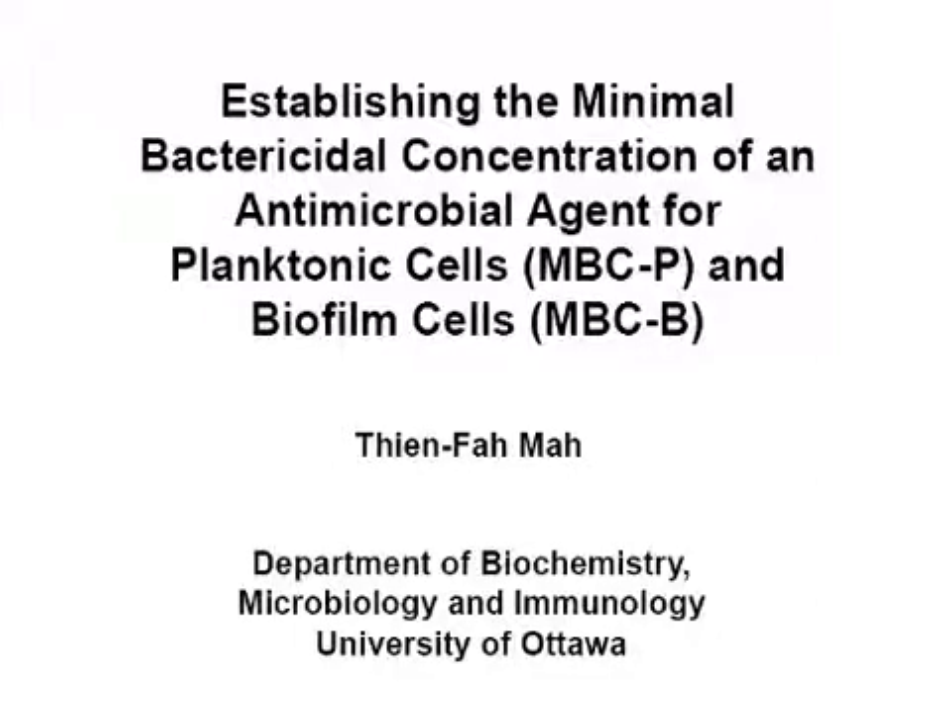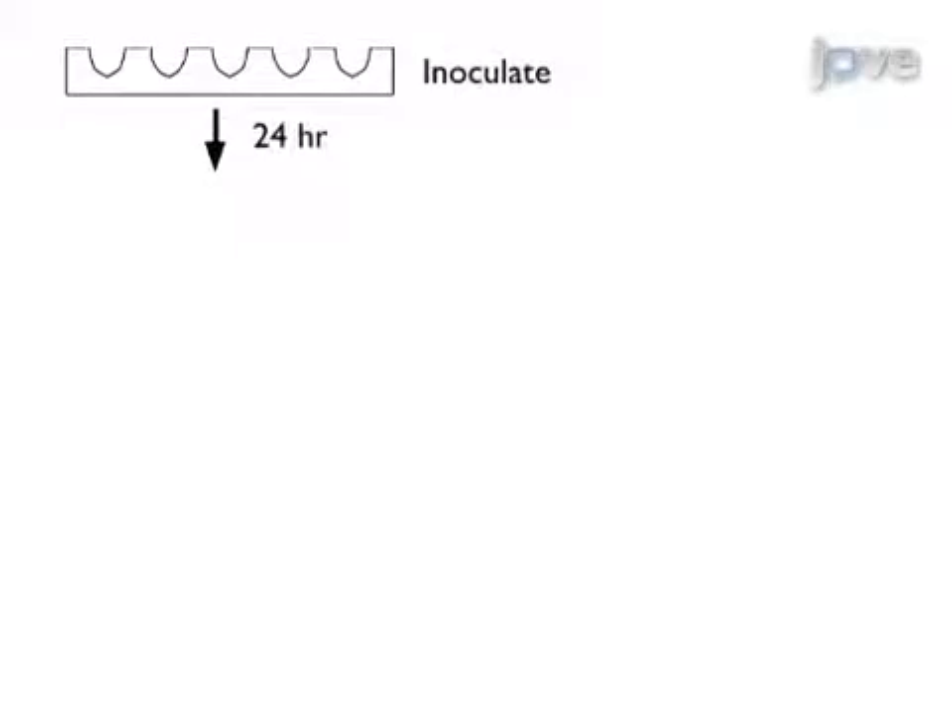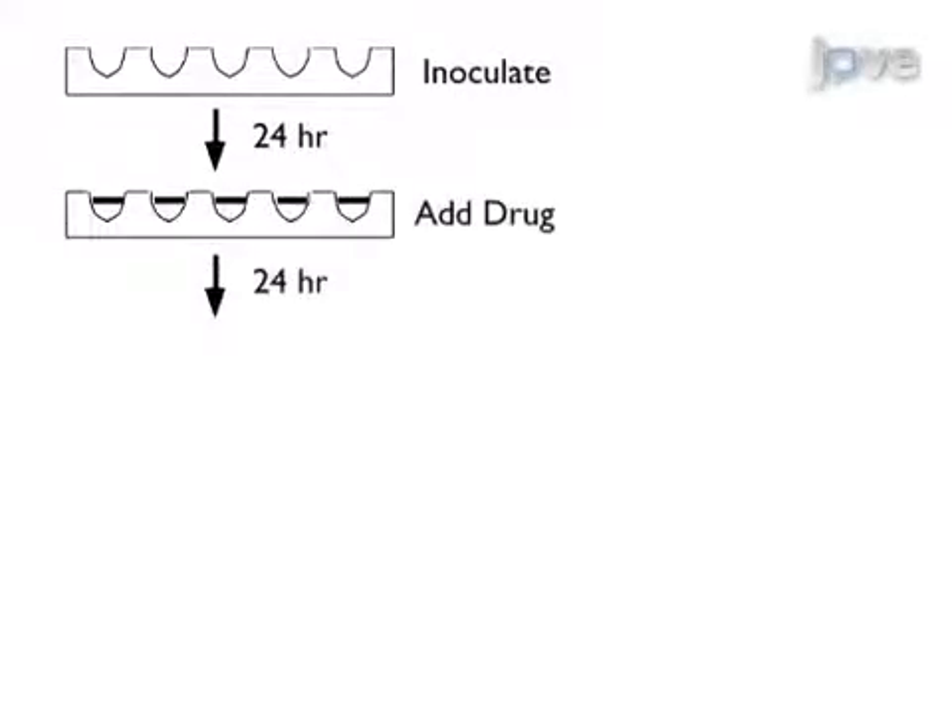This procedure directly compares planktonic and biofilm resistance for a bacterial strain that can form a biofilm. First, establish a biofilm, then replenish the media and apply serial dilutions of the antimicrobial agent of choice.